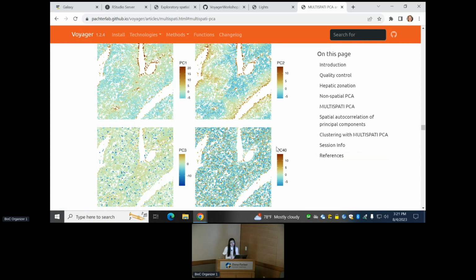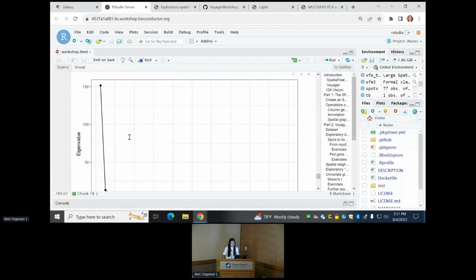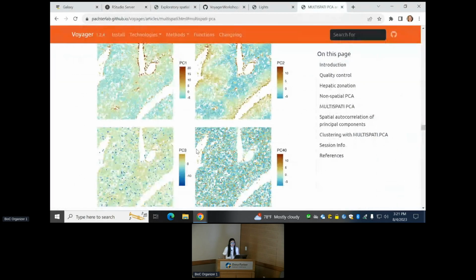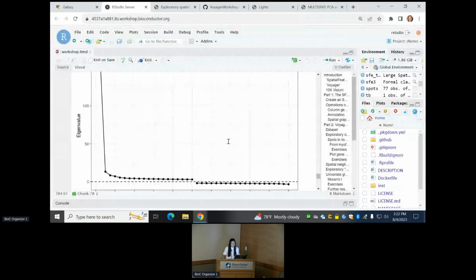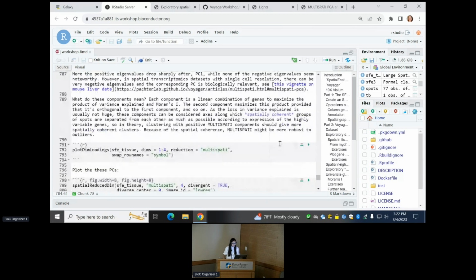But here for Visium, it doesn't have single cell resolution, you're actually binning over many cells in space. So the interpretation of Moran's I or any spatial metric will be different from those from MERFISH, which has single cell resolution. And I think that probably because of the binning, it smooths over a lot of what may otherwise be a negative spatial autocorrelation. So we don't see it here.